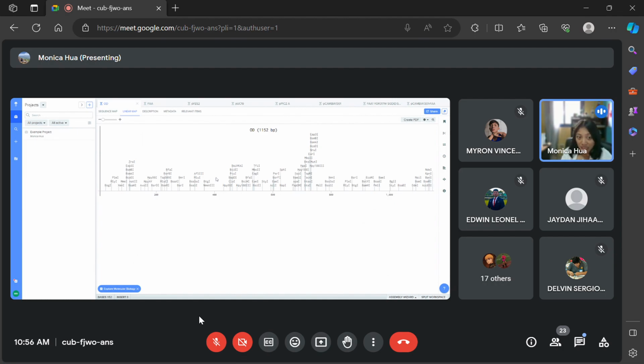Because if, let's say, I choose NspI as my restriction enzyme, it's going to cut my DNA almost in half, which makes OD non-functional, because it's not going to be a complete sequence. So you do not want to choose a site that is on your DNA template.